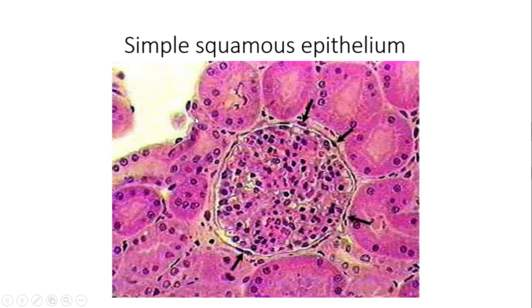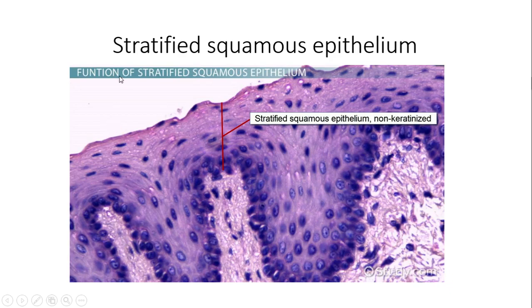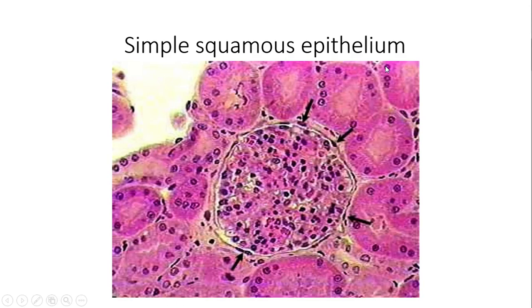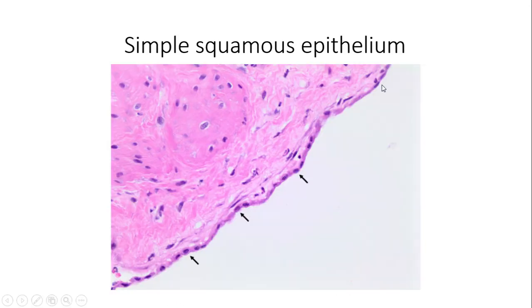So you're going to notice when we're looking at different epithelial tissues, there's open spaces. This is not the best example, mostly this one right here and over here. But for example, we're going to see that as characteristic of epithelial tissue. But for simple squamous, we're only looking where the arrows are shown right here. So when we're looking at the arrows, I see that these nuclei look all very flat and their cells are very flat. And remember, squamous means flat. Okay? So we're looking at one layer of simple squamous epithelium lining this body cavity here.